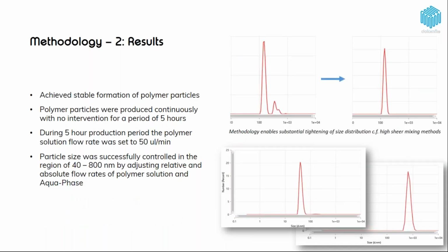Now, what happens if we look at the results? Remember, I mentioned that in continuous flow, typically, when you undertake micromixing, you will have adhesion of particles to the walls. And in the first slide on the right, you can see typical results from DLS obtained this way. So you do get 100 nanometer particles in our micromixer chips, but you also get a long tail of particles in the 300, 400, 500, 600 region. And that creates this broad size distribution.